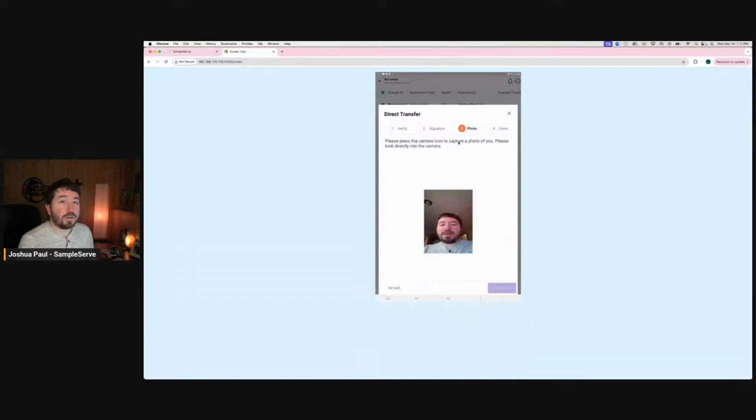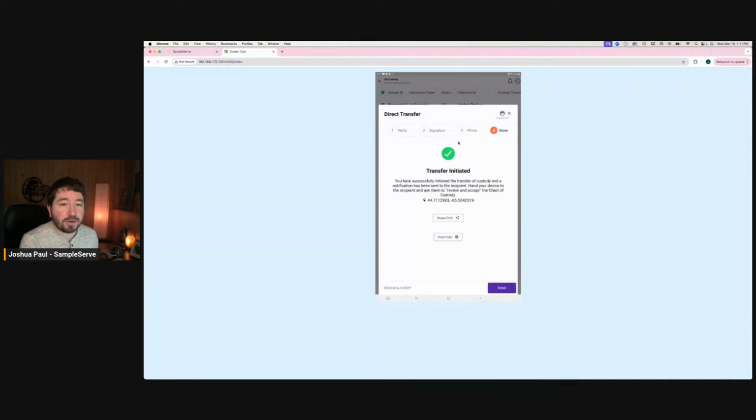And so what it's going to do is go out and generate that chain of custody, so I don't have to do a thing. I don't have to write anything down. I don't have to fill out multiple sheets or anything like that. I can print a custody seal, throw that on the cooler or on the outside of my Suma canister, and the lab can scan that to pull up that chain of custody using our lab app. I can also share that COC through an email.